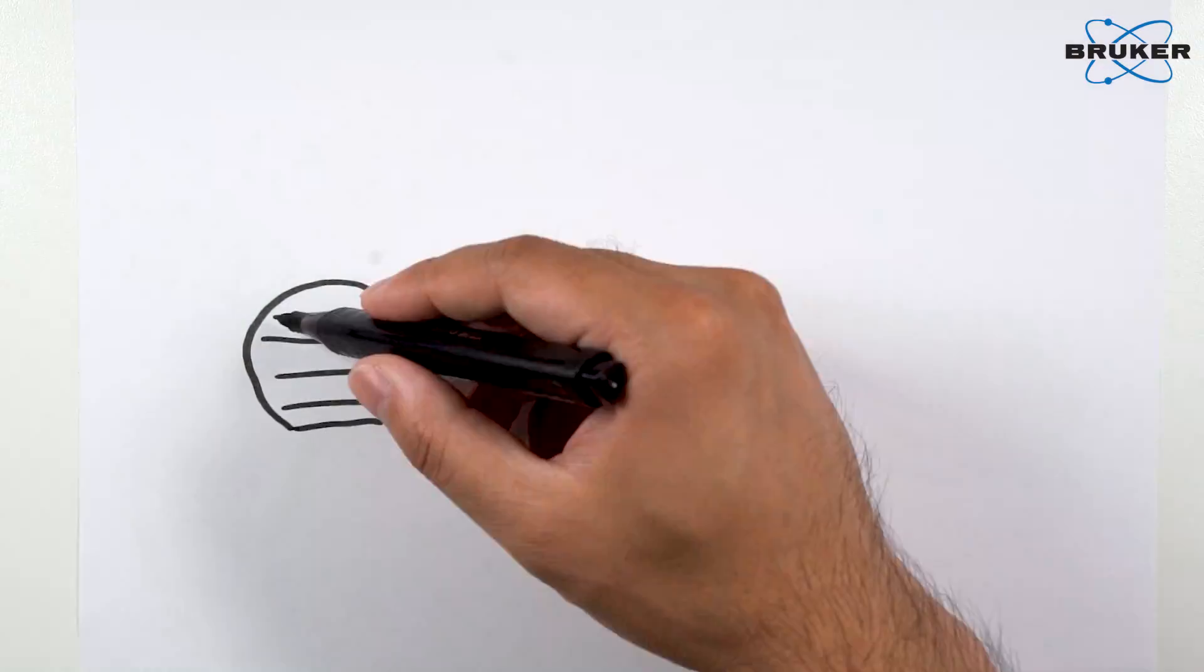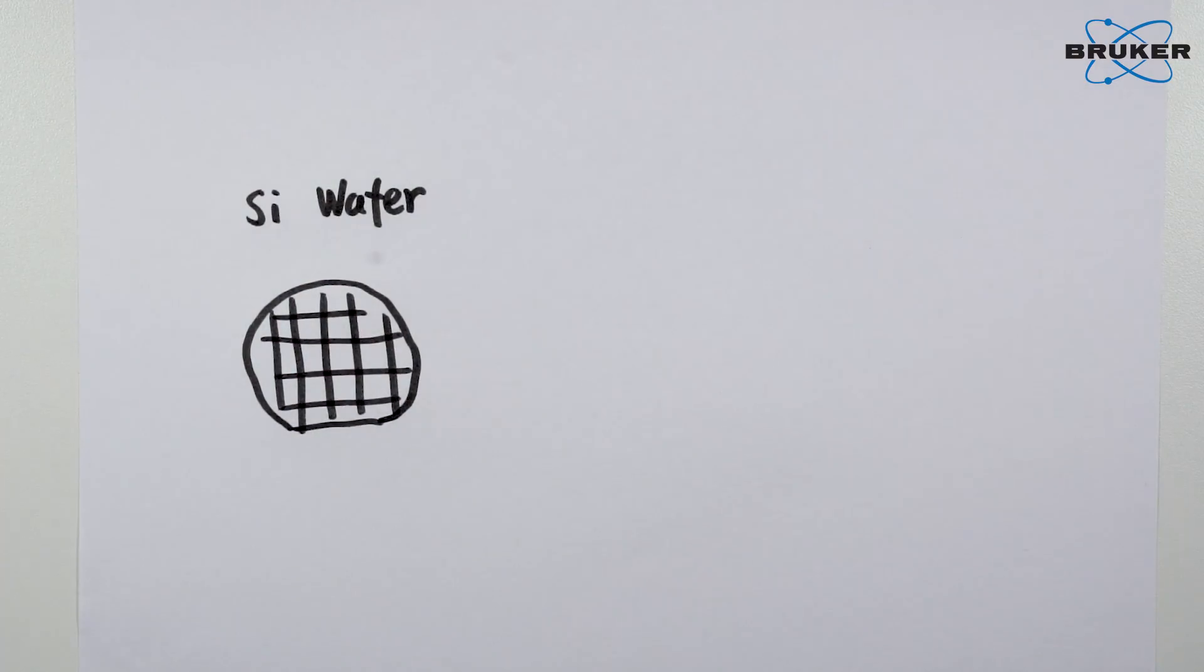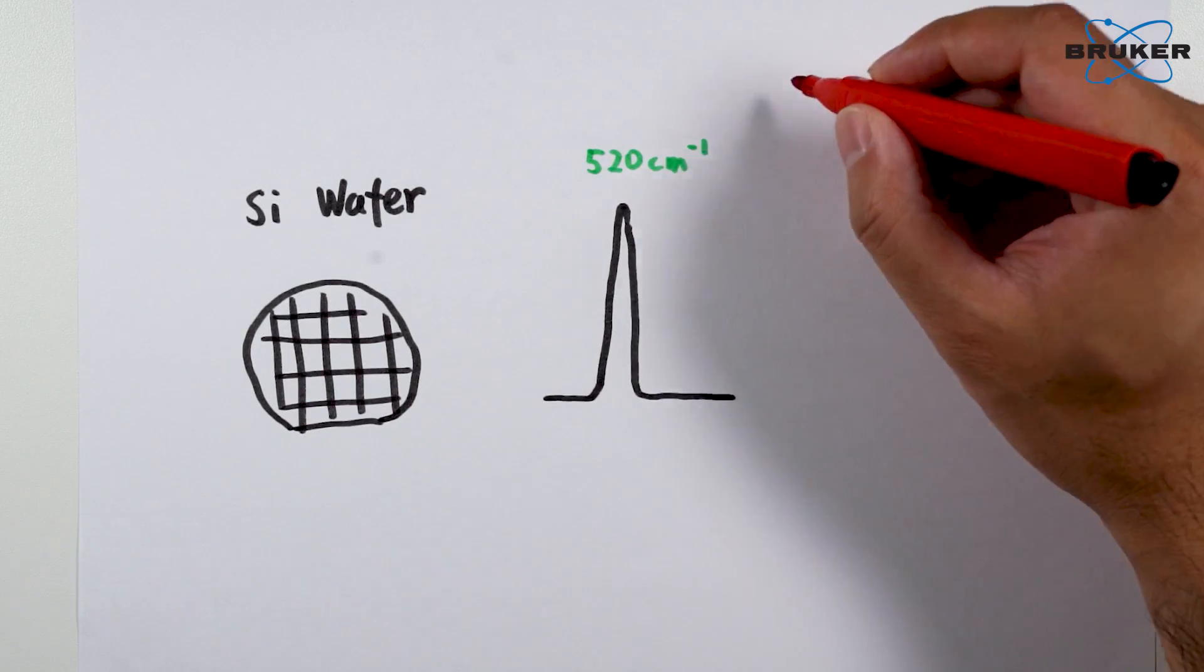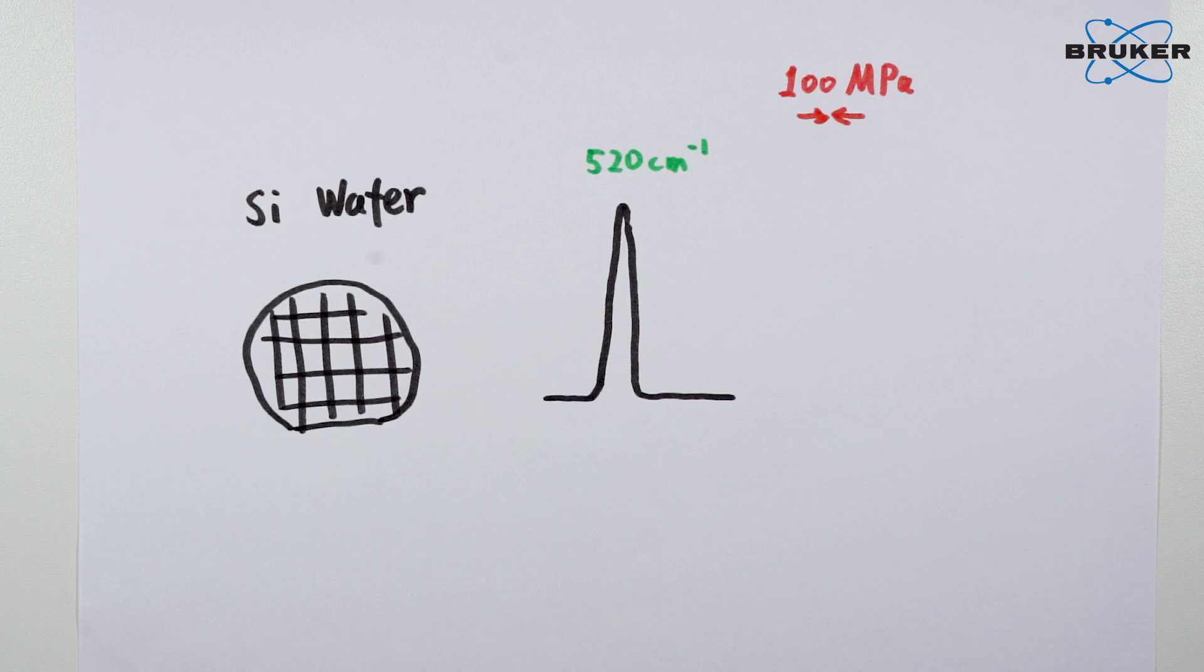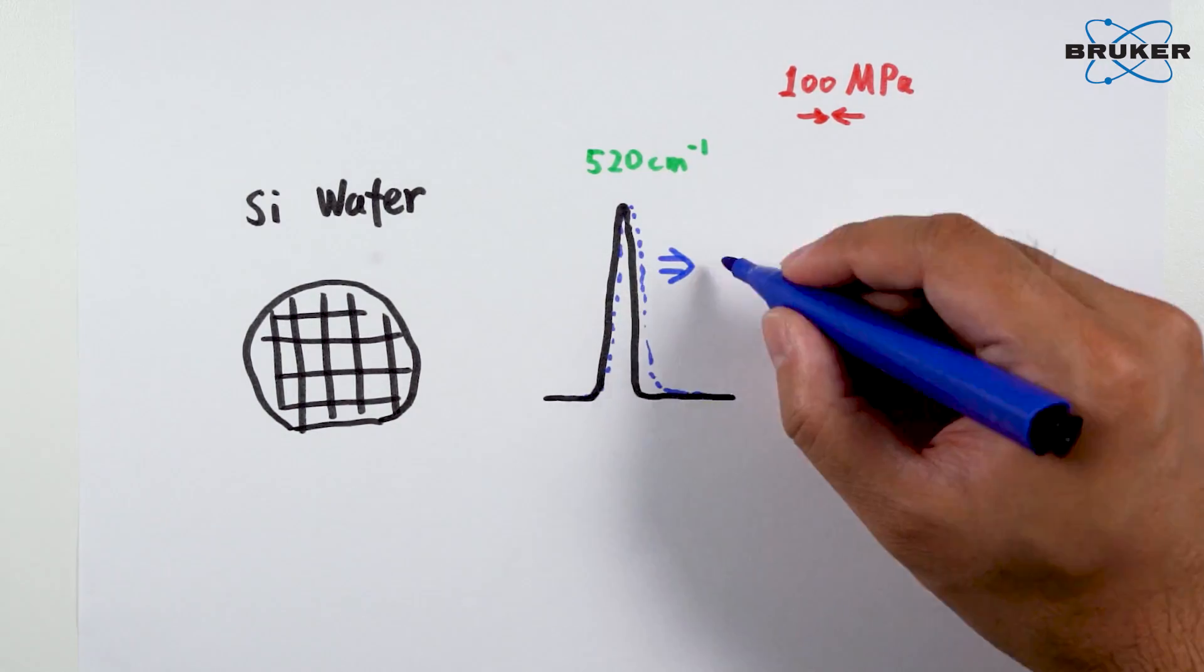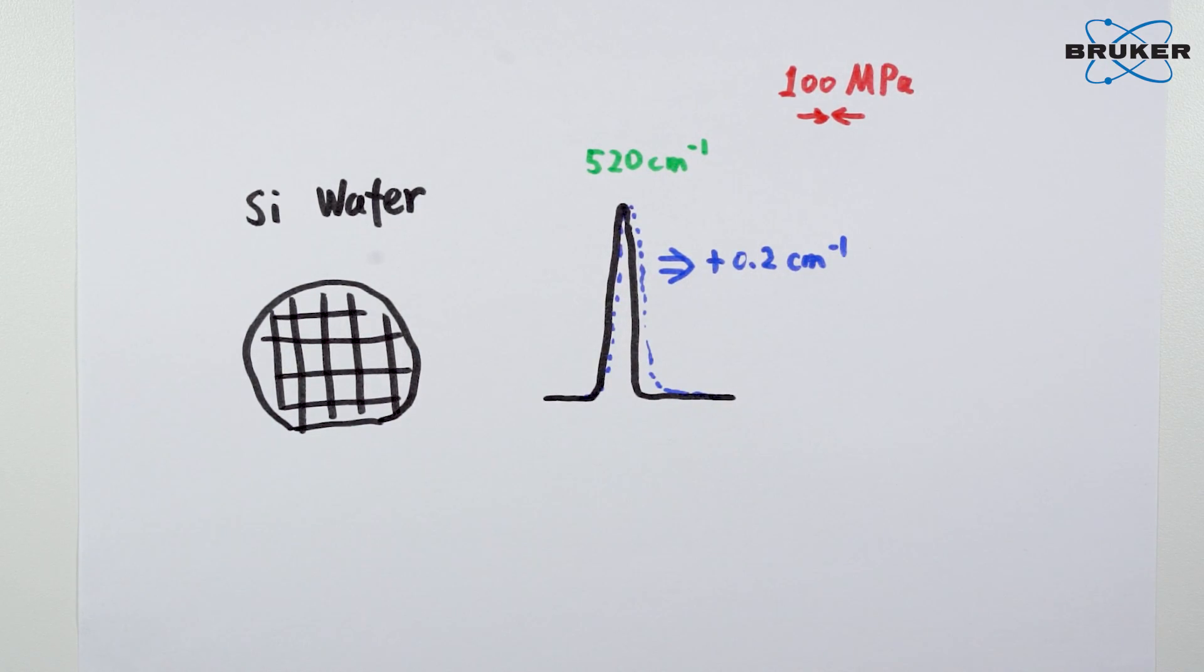Some experiments fundamentally rely on good calibrations. Take the monitoring of the stress in silicon wafer for example. 100 MPa stress only causes a 0.2 wavenumber shift of the Raman peak. A 1 wavenumber error in this case would lead to a 500 MPa error in the measurement.